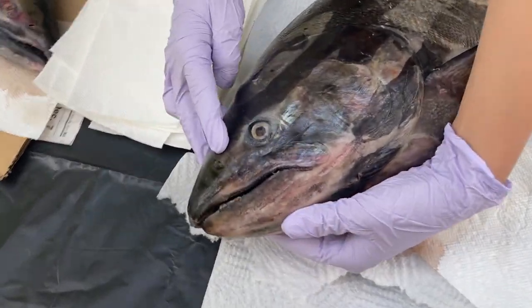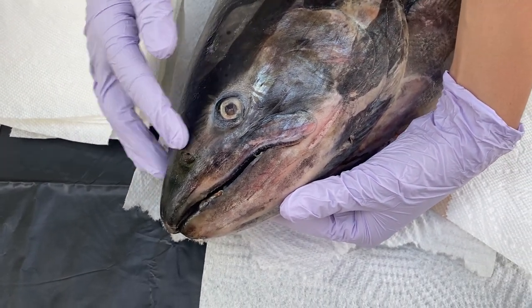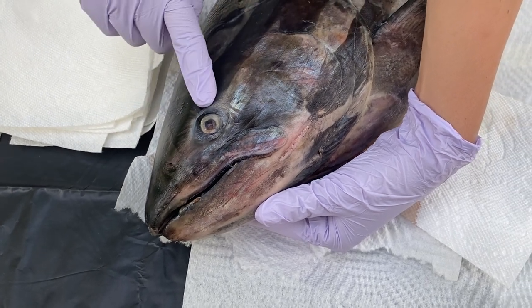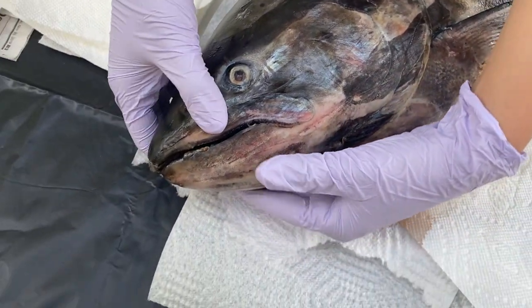If we start with the head of this fish here, we can see that there are two little holes on each side. These are the fish's nostrils. Fish do not use nostrils for breathing like humans do. Fish use nostrils for smelling. They have an eyeball, much like humans do too. They use them for the same thing, for seeing, but they don't have any eyelids, which we do.